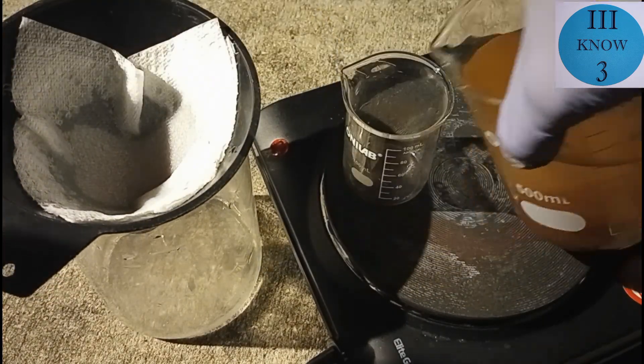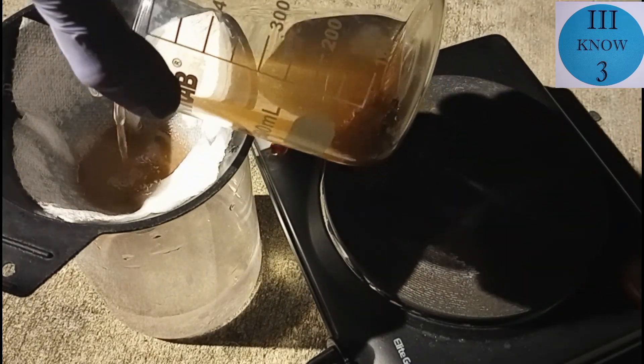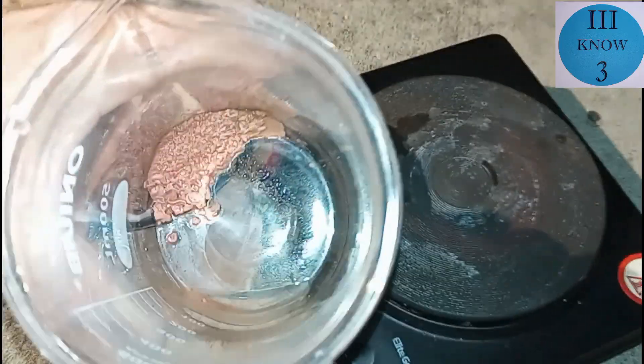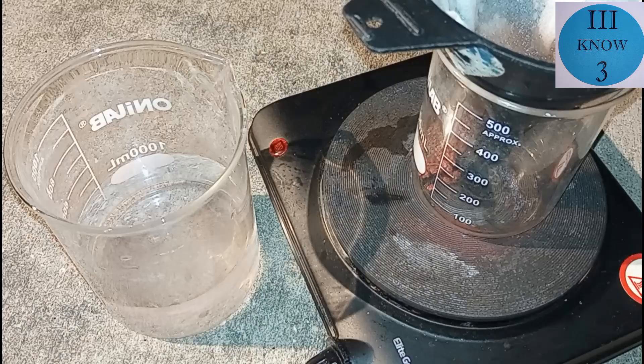The smaller beaker here was what I decanted off, and the larger beaker contains wash water for the copper sediment. There you can see the copper. I ran the clear solution through a paper filter a couple of times to make sure that we got all of the suspended copper out of it.